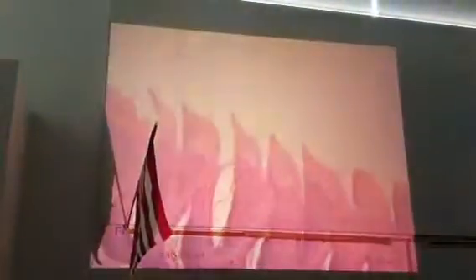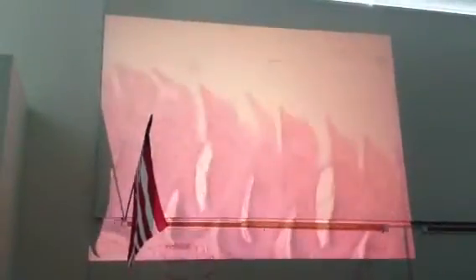So this is stratified squamous, non-keratinized epithelium. Taste buds are along the side. In filiform papillae, they're just spiky. They don't have any taste buds. And here's a filiform papilla. Okay, no taste buds with those.